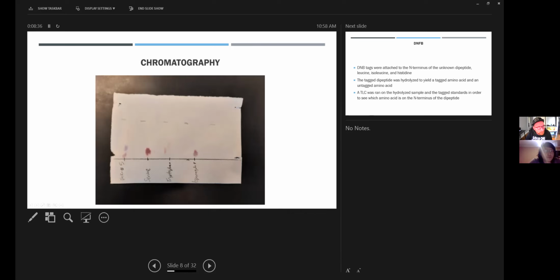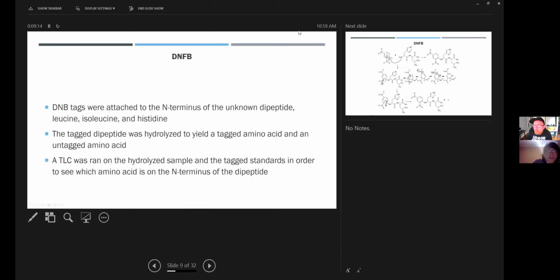Thankfully, our chromatography on the first day actually came out very, very well. On our unknown here, number 5 is just indicating the quantitative number that was given to us at the beginning. So we had the 5th unknown, and all the other groups had 4 and 6 and 1 and 2, etc. But our chromatography actually came out very, very well, and we got some really good readings.